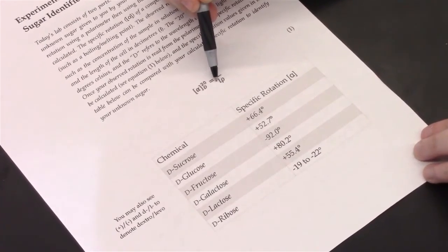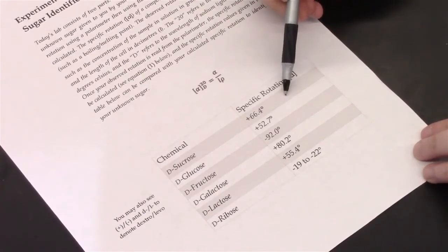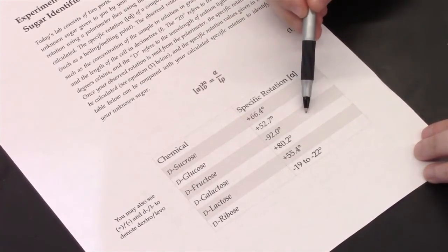This final optical rotation reading can be used and compared to known literature values to determine what the compound at hand is.